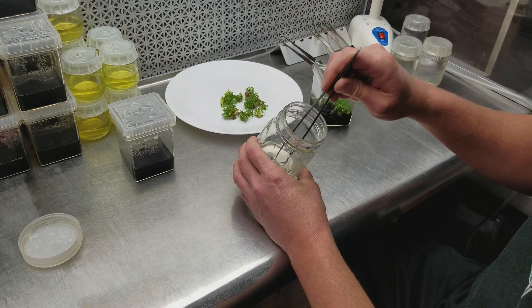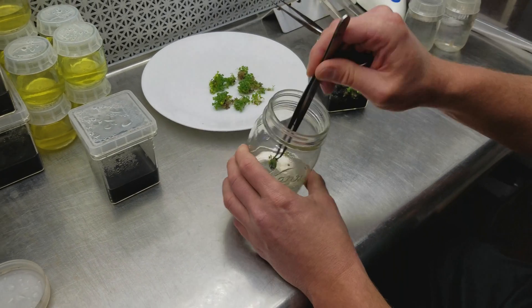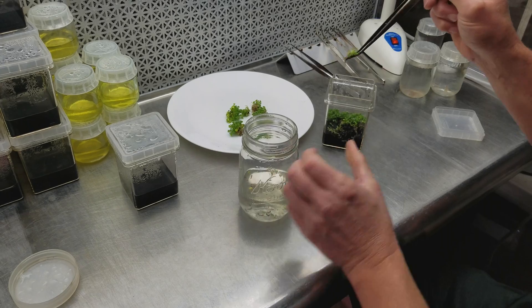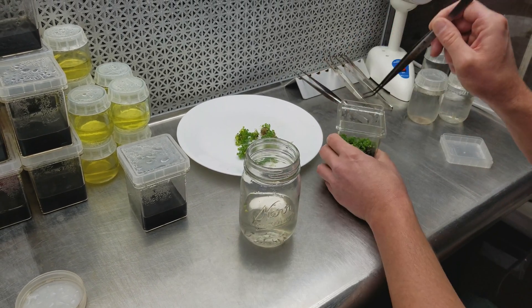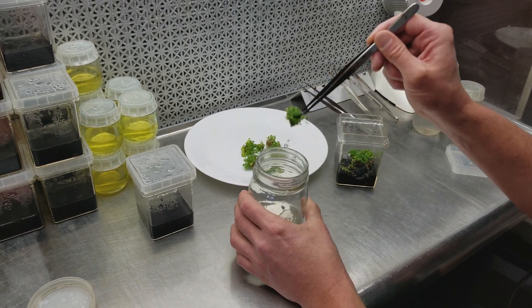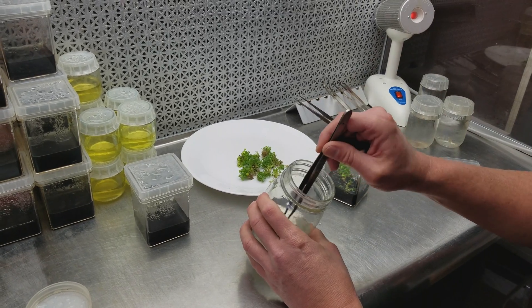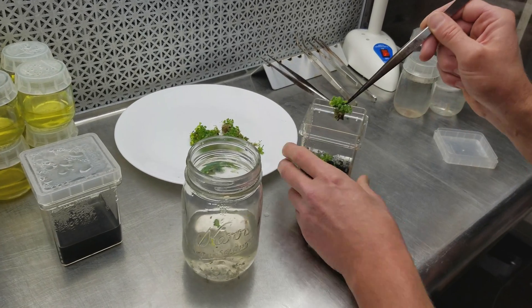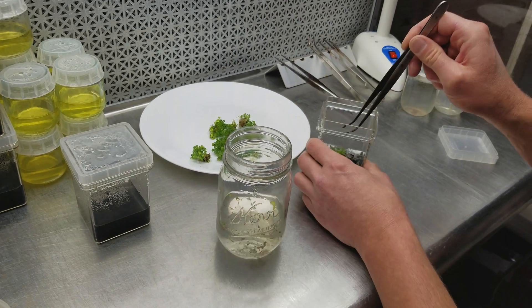If I get behind — which does happen — you end up with a lot of dead tissue and then you have to spend a lot of time cleaning between replates. Last year I got pretty far behind in the winter and ended up spending a lot more time out here cleaning cultures than I wanted to. When cultures are cut out late they don't do as well. There's a time cycle for every different type of plant and you want to keep on that cycle for both replates and potting out to get the best survival rate.